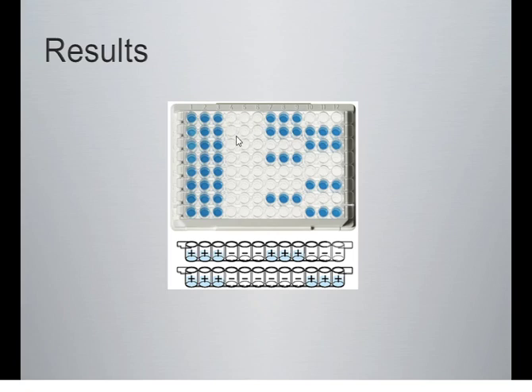Now the negative control, this is to make sure that you don't get false positives. In these samples, you don't put any of the protein, any of the antigen. You coat the wells afterwards with that detergent, and then when you put the primary antibody in there, it has nothing to attach to. So when you wash these wells out, the primary antibody washes out. Then you put the secondary antibody in there, it has nothing to attach to, so it gets washed out in the third wash step, and there's nothing in there.